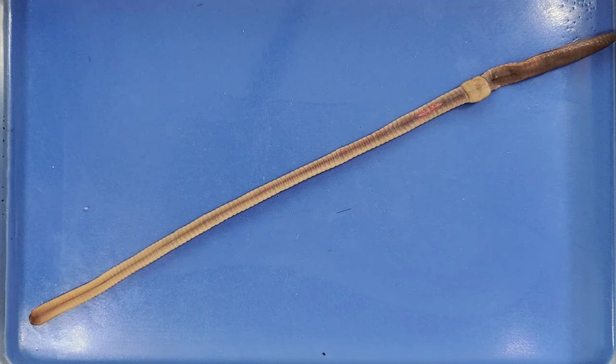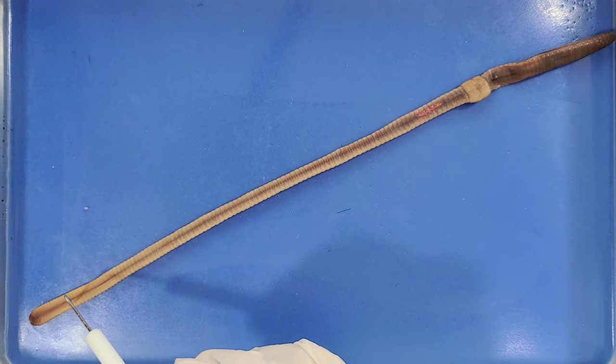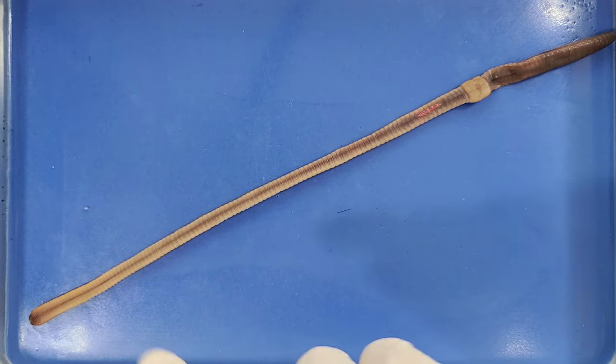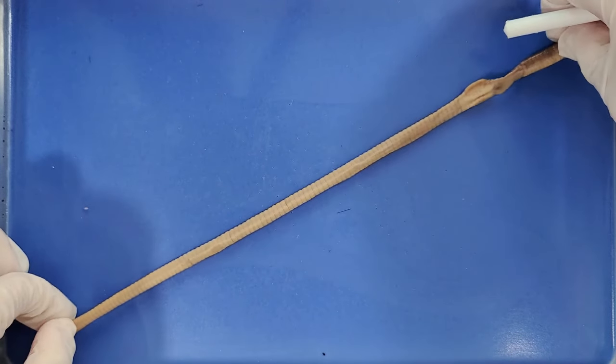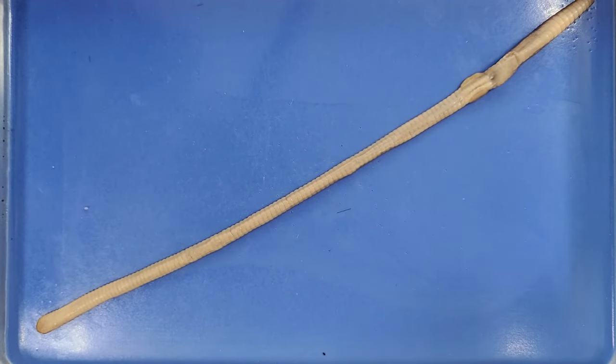This clitellum also helps us orient the worm. The part closer to the clitellum is the anterior end, meaning this is the head. The other end would be the posterior end, meaning towards the rear. This darker side is the dorsal side, or the back. And when I flip it over, this lighter side is the ventral side, or the stomach.